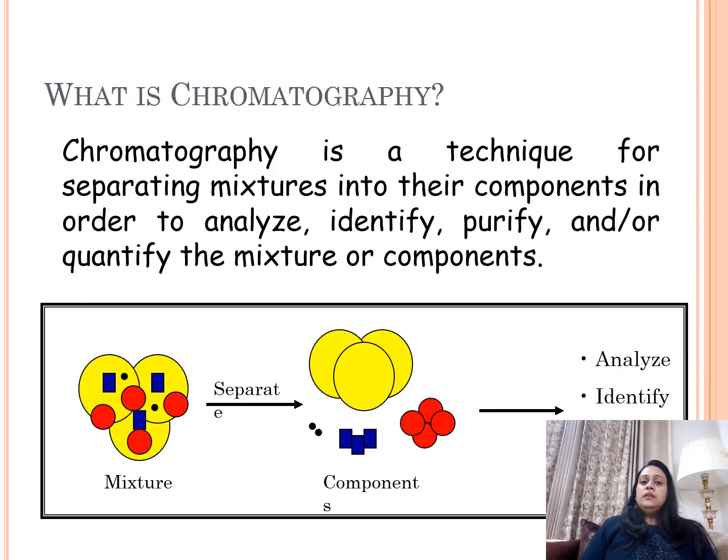So you can see this. We are going to separate a mixture. Suppose, for example, the mixture has these four components: the yellow one, red one, blue one and the black one. So we are going to separate this mixture into different components. The purpose is to analyze, to identify, to purify and to quantify what the mixture or component has.